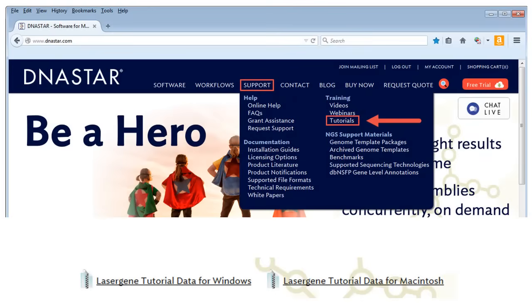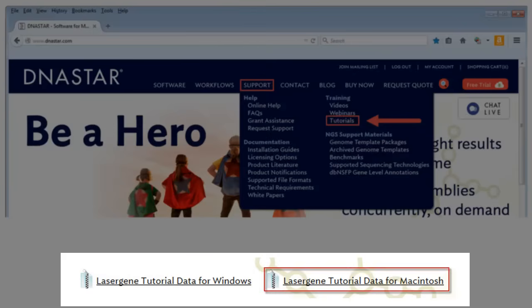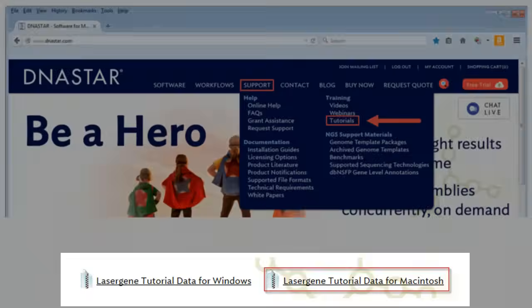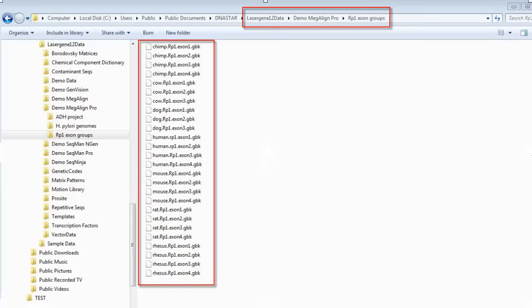If you'd like to perform the alignment on your own computer, the data files can be downloaded from our website by clicking on Support, and then Tutorials, then clicking the link for either the Windows or Macintosh tutorial data. Once you've unzipped the files, you'll find the data for this tutorial in the Demo MegAlign Pro folder.